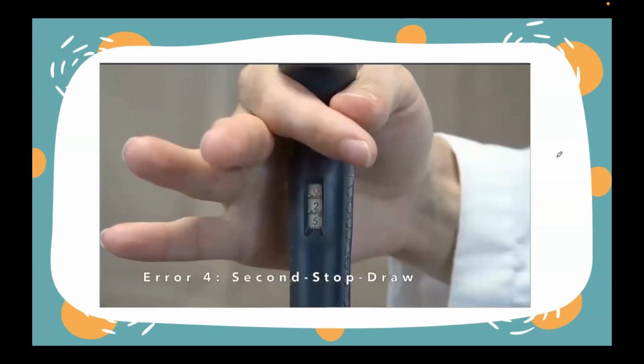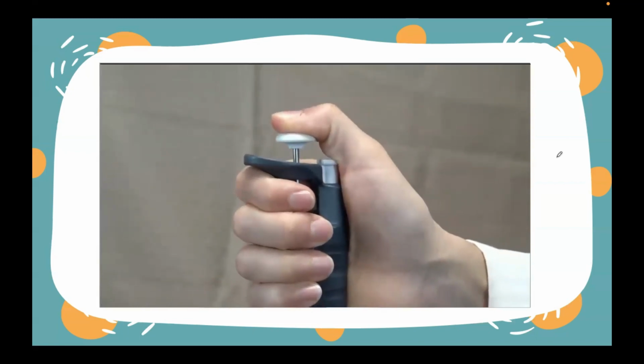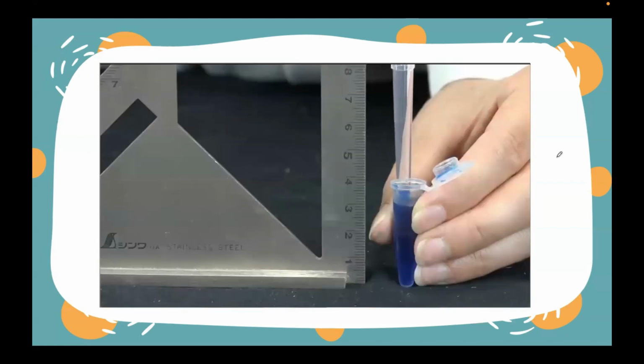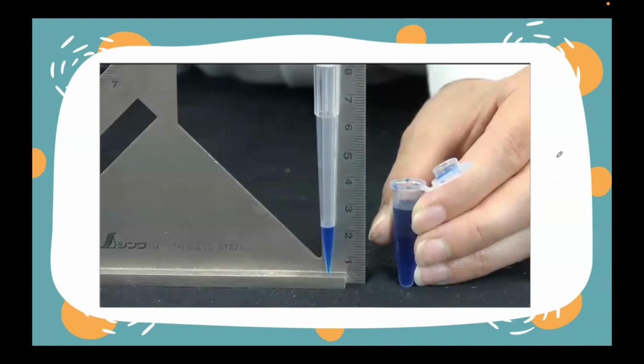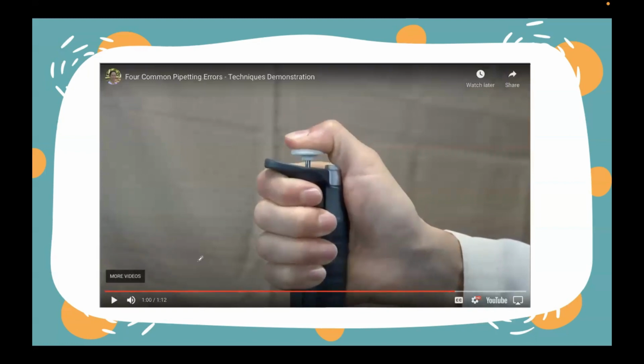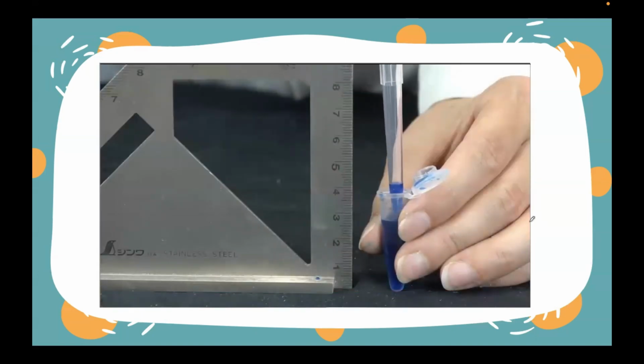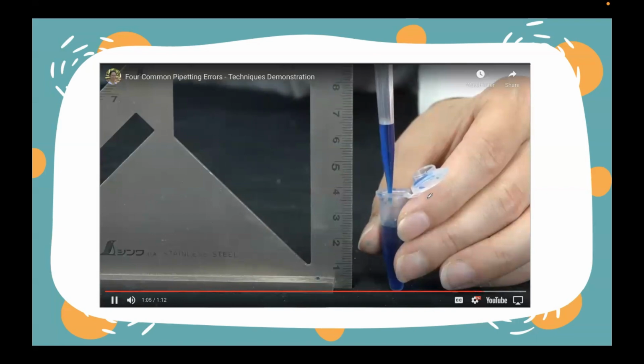So ito yung most common error. I've set this pipette to 250 microliters. If you pipette properly by pushing to the first stop, you draw up exactly 250 microliters. Ayan, if instead you push all the way to the second stop, kapag nag-aspirate tayo, first stop lang. Yung second stop, ginagamit yun pag nagde-dispense na. Kasi pag second stop yung ginamit mo sa ating aspiration, ito yung mangyayari. Tingnan mo, you draw up much more than 250 microliters. Ay no, ang dami. Hindi na accurate yung volume mo.